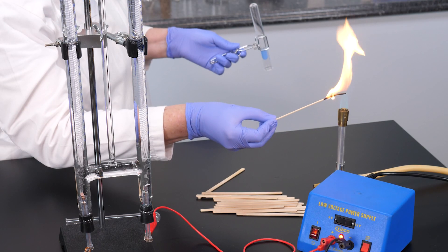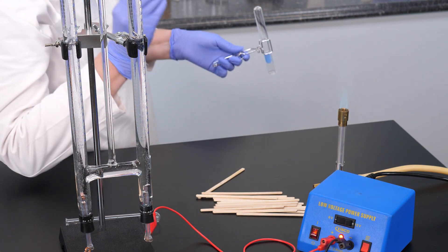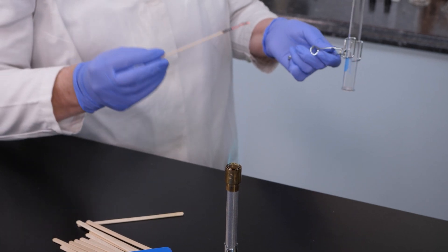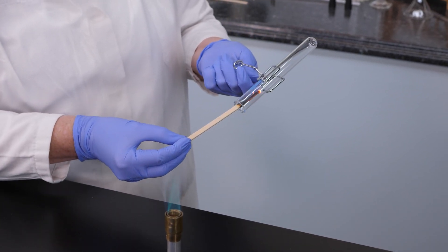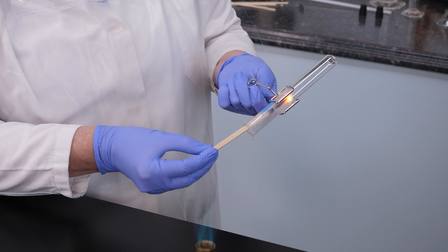We also used a wood splint to prove we collected oxygen gas. The oxygen in the test tube reignited the flame on the glowing wood splint, proving we had collected oxygen. By using electrolysis, we were able to decompose water into its component elements.